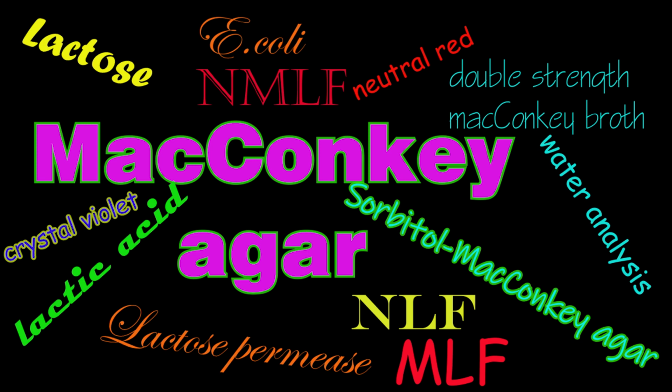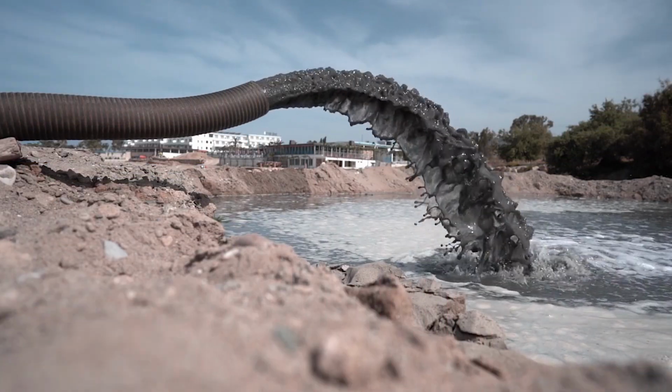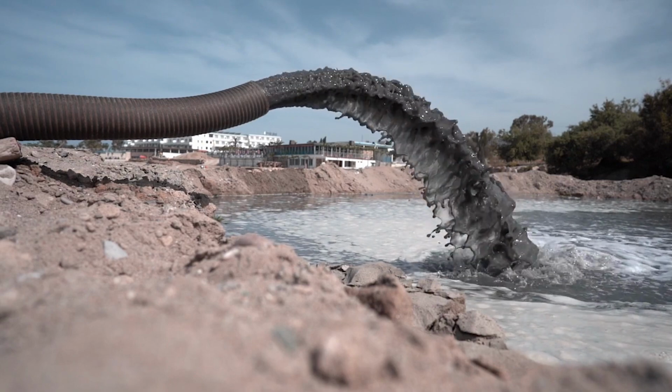In this video, we will discuss MacConkey Agar. MacConkey Agar was developed by Alfred Theodore MacConkey. He was a British microbiologist for the Royal Commission on Sewage Disposal, which reported on methods of disposing of sewage from factories or manufacturing processes.